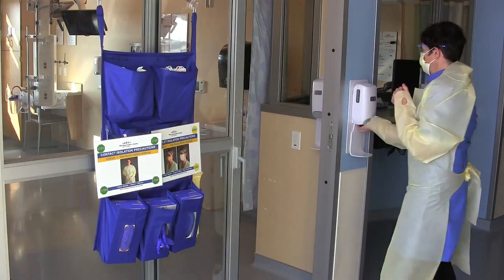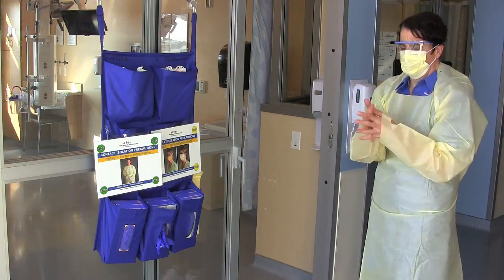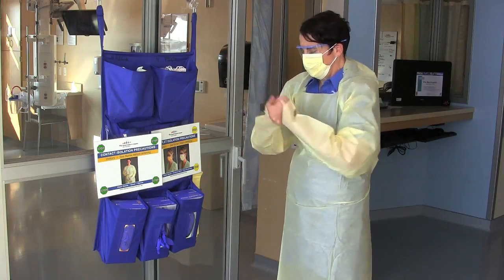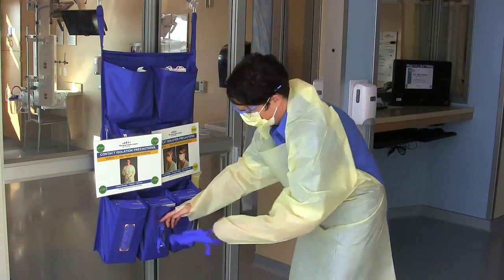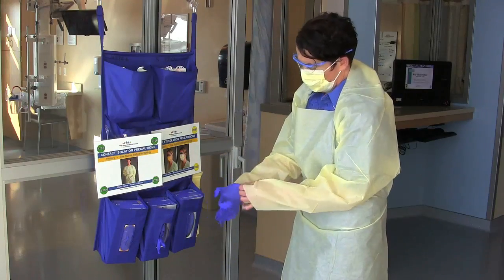Clean your hands. Apply one measure of alcohol-based hand rub. Rub your hands together between your fingers, around and under your fingernails, the backs of your hands, your wrists and palms until dry. Once the ABHR is dry, if your gown has thumb holes, place thumbs through the thumb holes. Place your gloves on your hands so the gloves cover the ends of the sleeves.